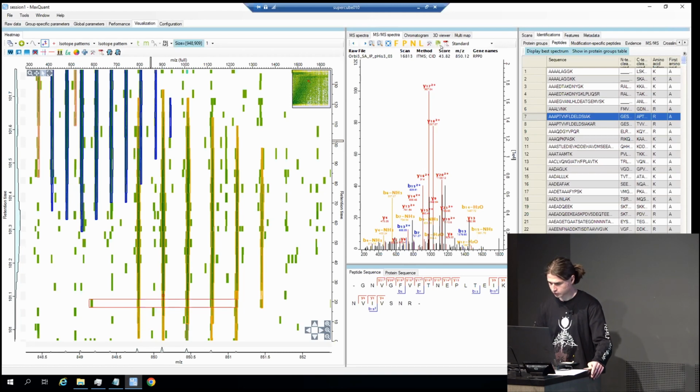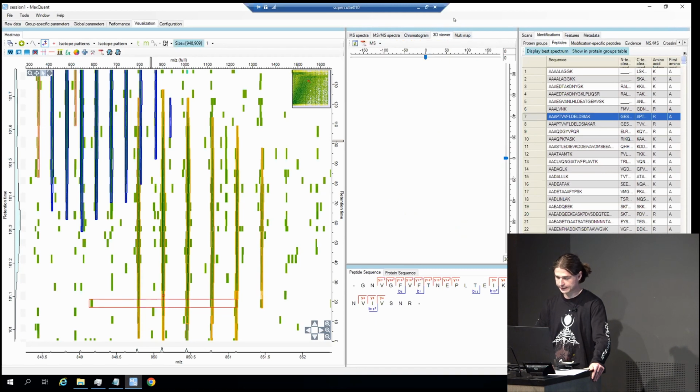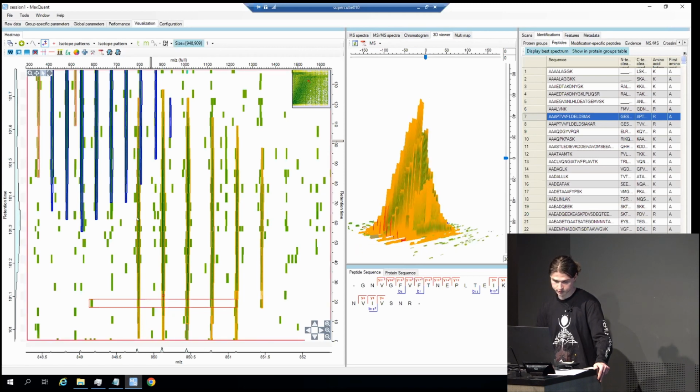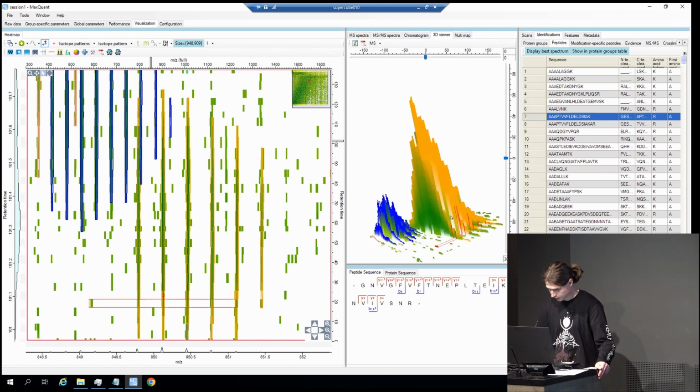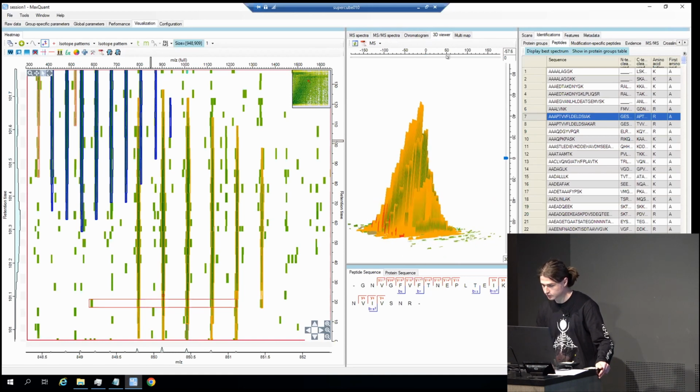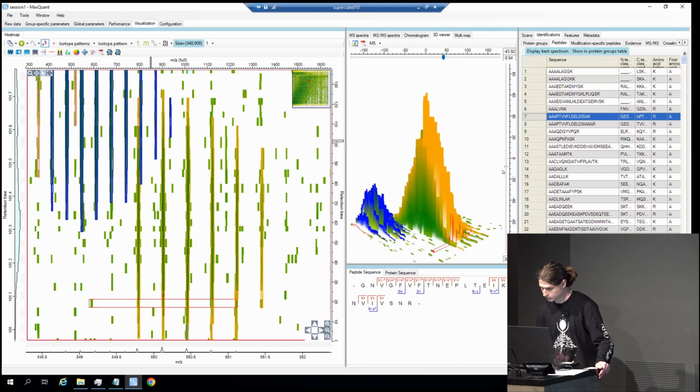So now we can go and see what other plots we can get from the middle part. Let's go to the 3D viewer. Here we would need to refresh the plot because it will not render automatically. It's quite computationally intense and we don't want to trigger it by accident. But we refreshed. Now we see the same part of the heat map, but in 3D. We can either drag it to look around, or we can use these things here.